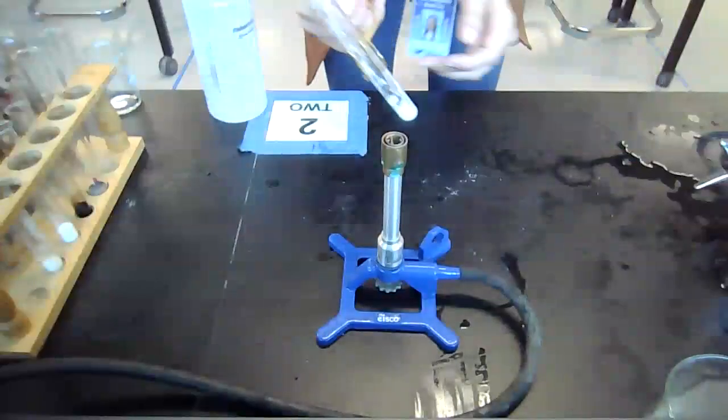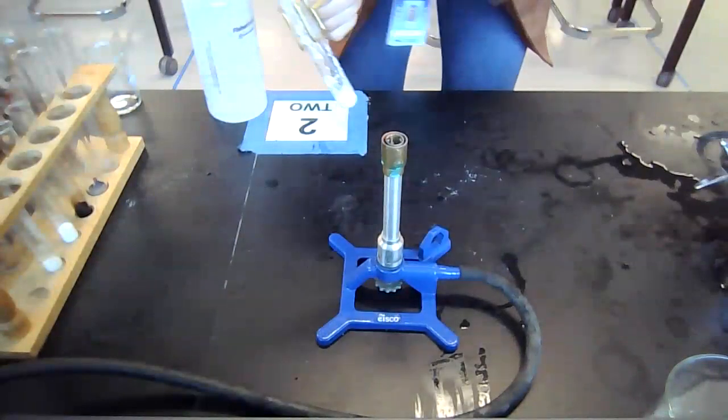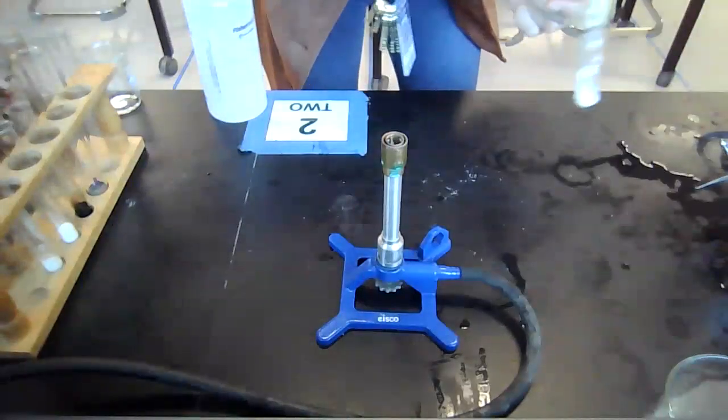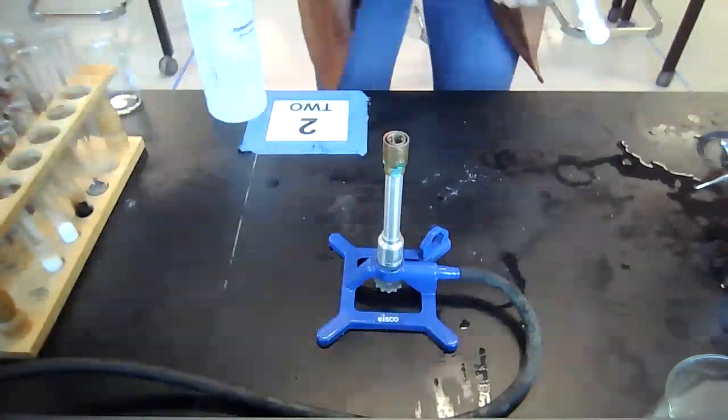Last test we have is melting point. So I've added just a little bit of each solid into an individual test tube. I'm going to be starting with paraffin. You can just look at the time on the video for when it starts to melt. But my first step is to light my Bunsen burner. So I'm going to turn my gas on. Open my gas line a little bit at the bottom.